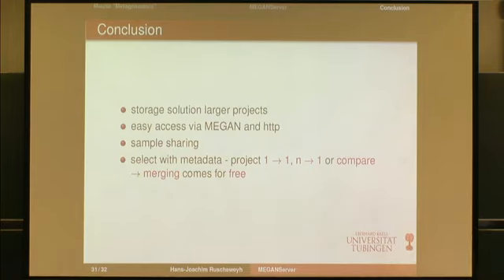Selecting with metadata is important. You can project in any way, like one-to-one, n-to-one, or compare. And merging comes for free, absolutely for free.